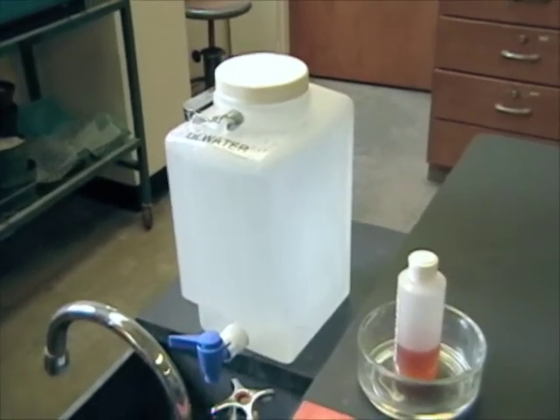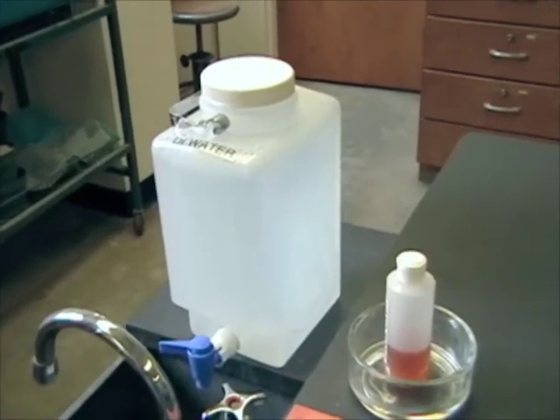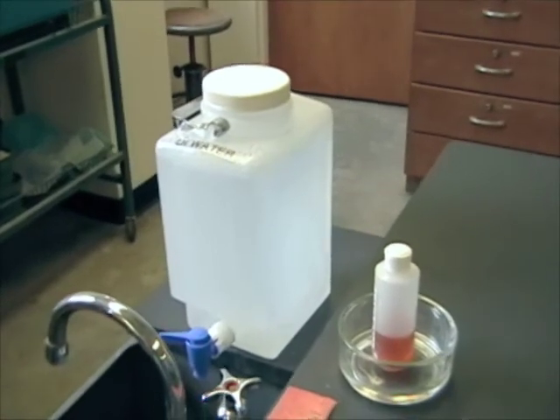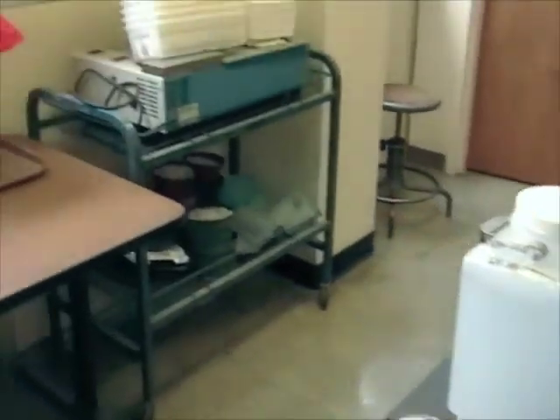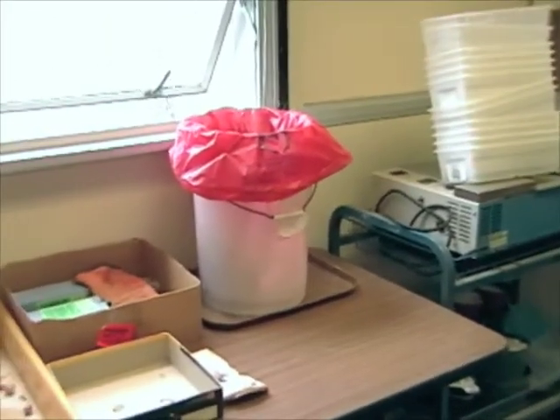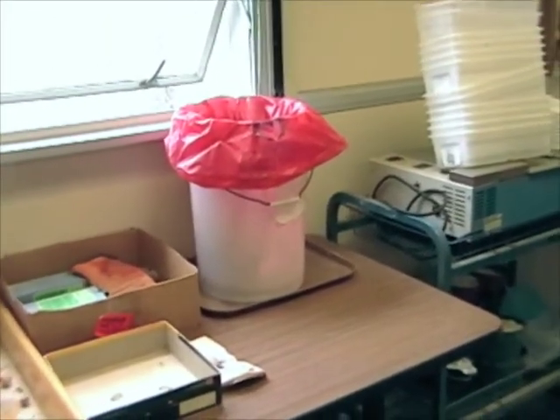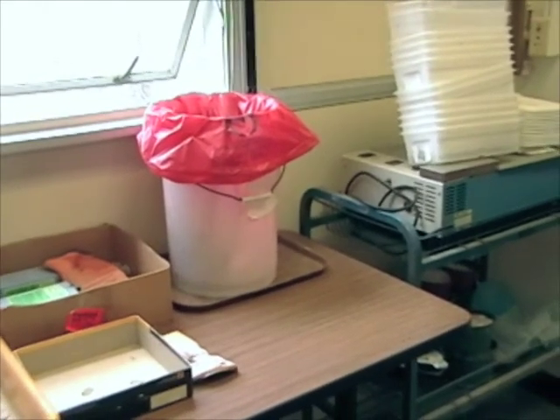One thing that you'll need for this activity is distilled water. And there is a carboy of distilled water located at each sink in the lab. Another important thing about this is that anything that has been exposed to saliva needs to be thrown away in the biohazard waste, this red bag, which is in the back of the lab.